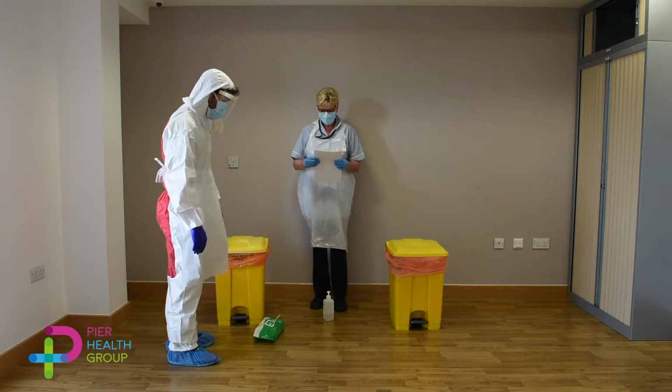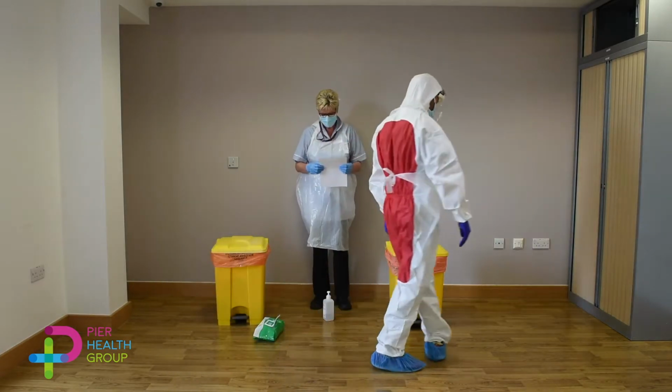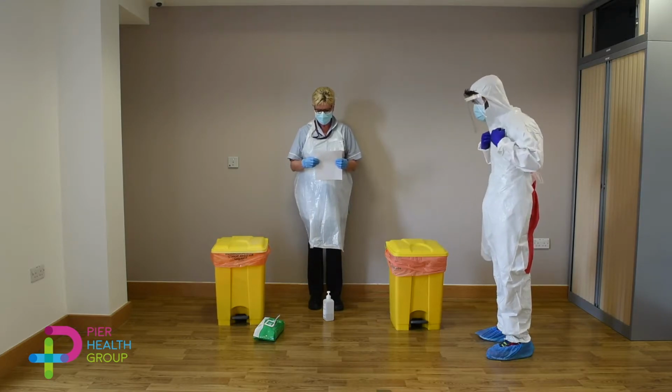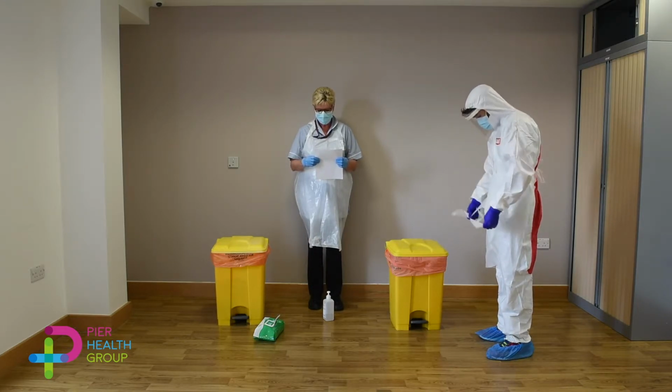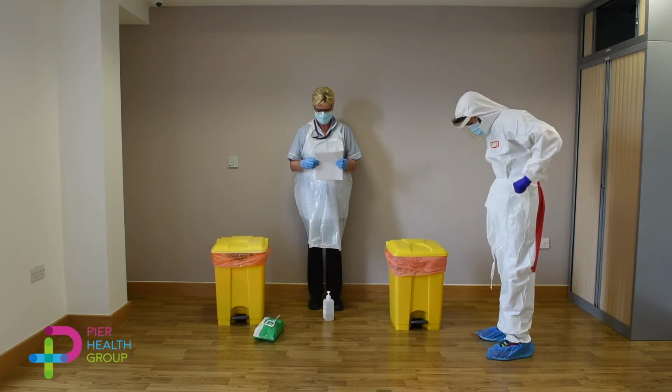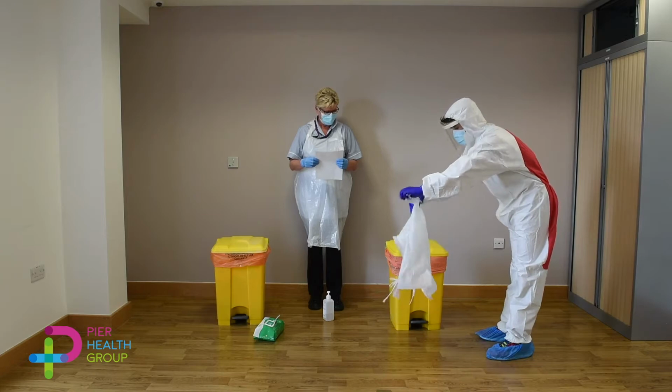Step 2. Step forward into box B and face the clinical waste bin. Step 3. Pull apron from the top and fold in on itself. Pull from the waste and place into clinical waste bin.